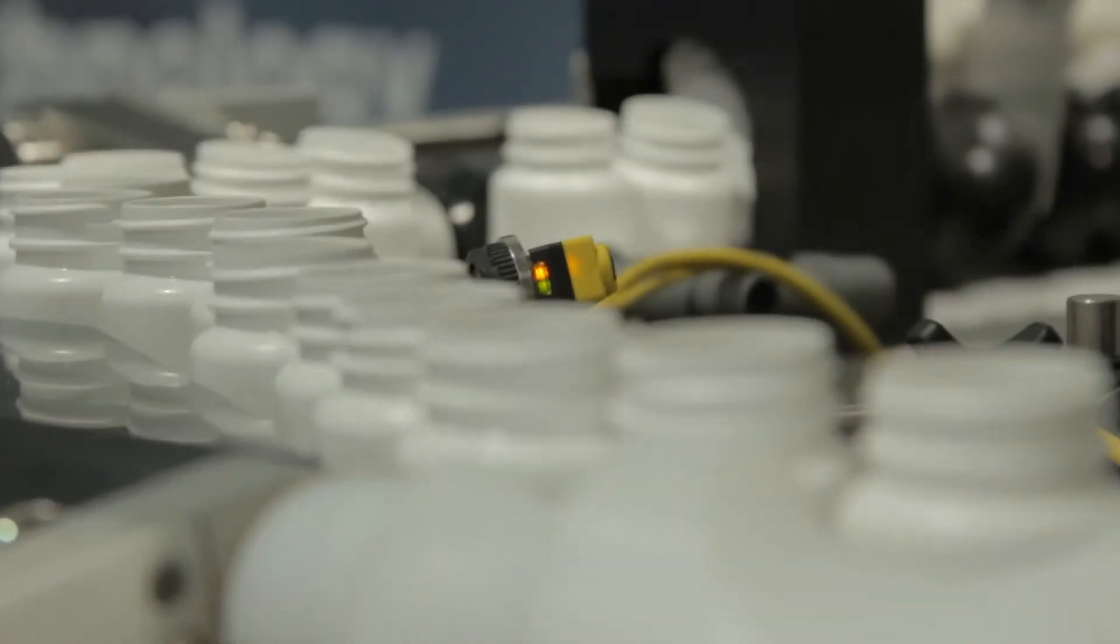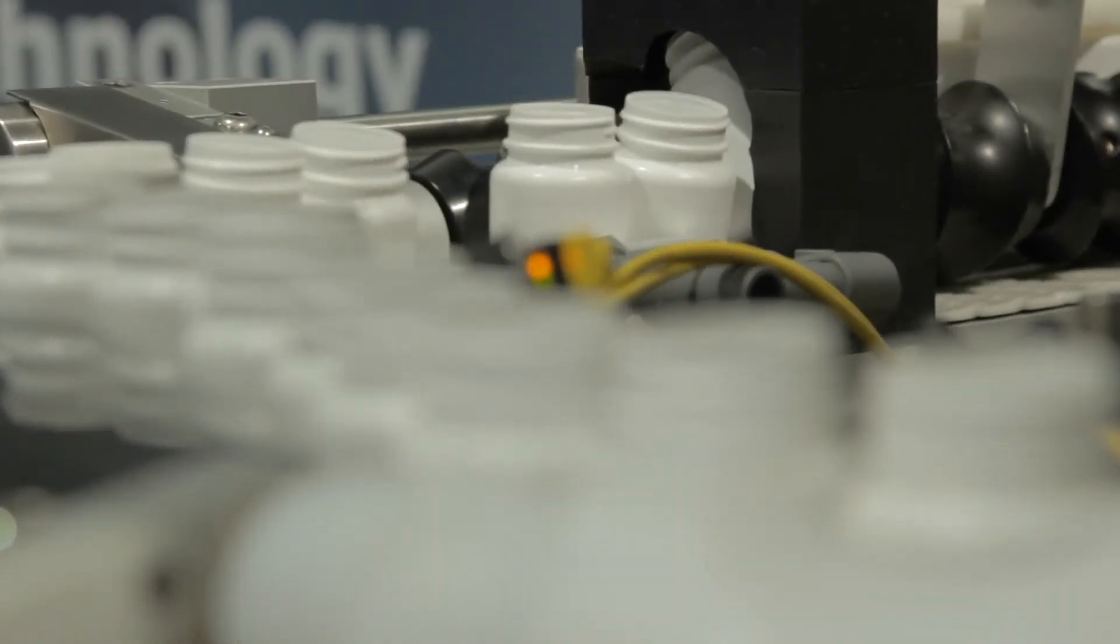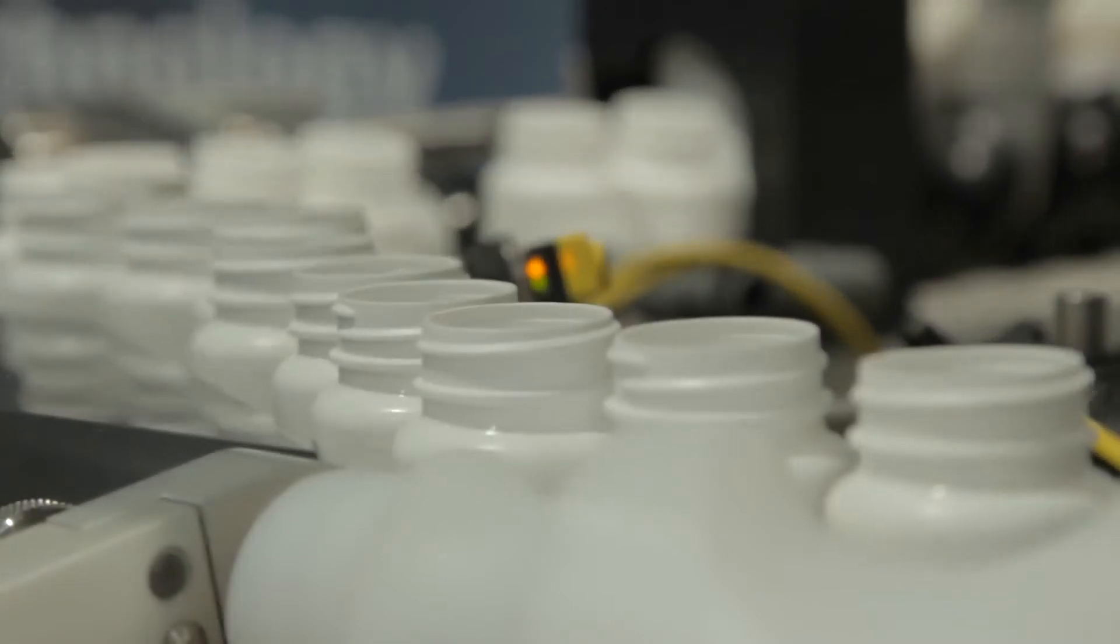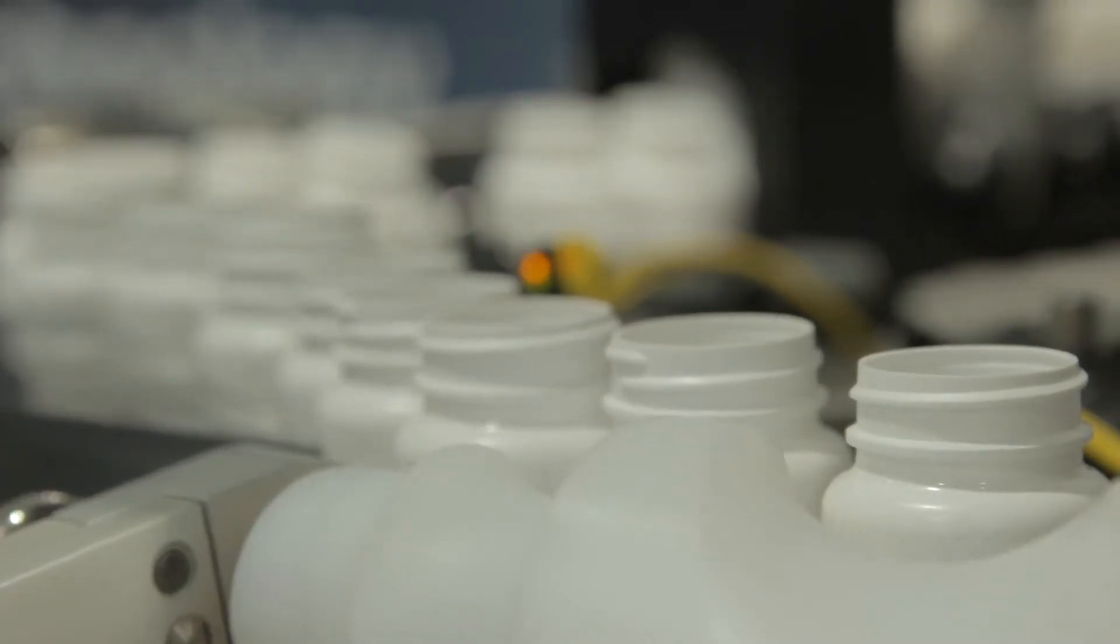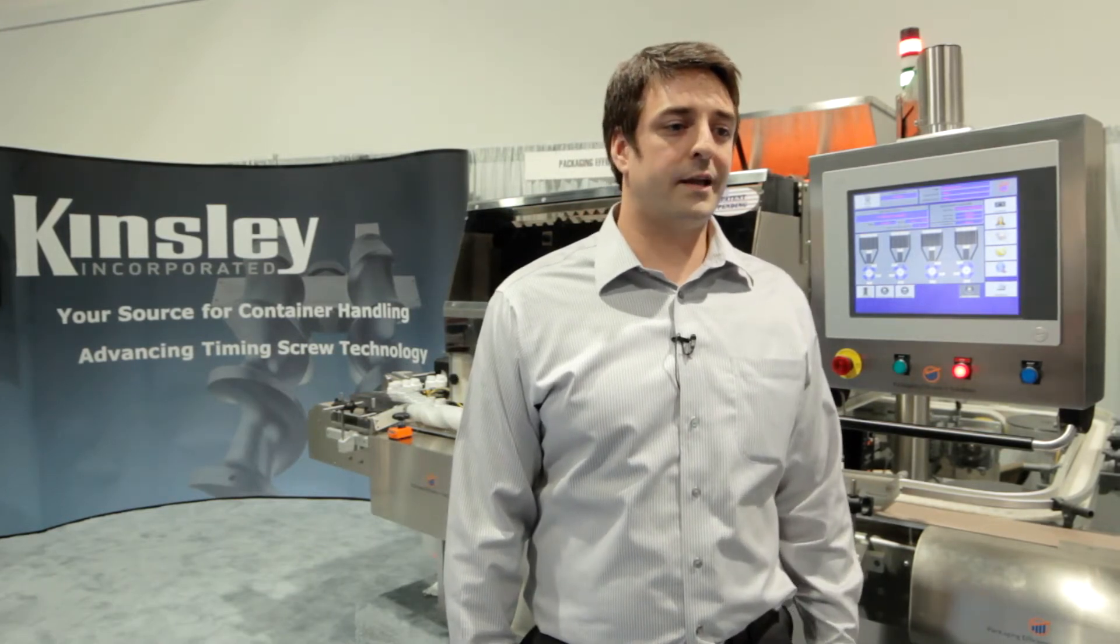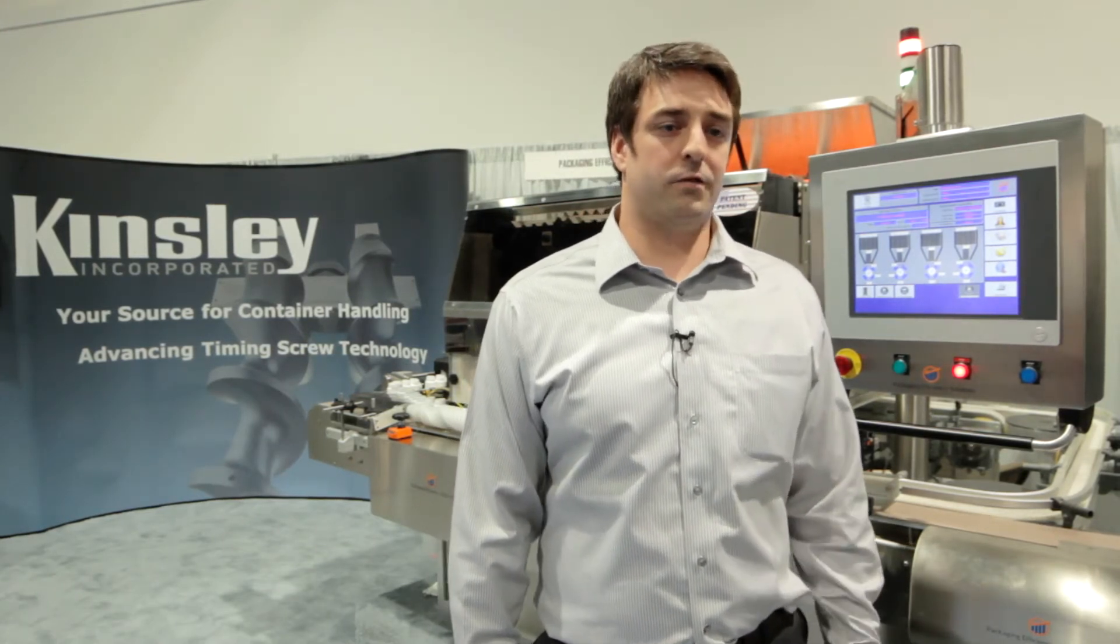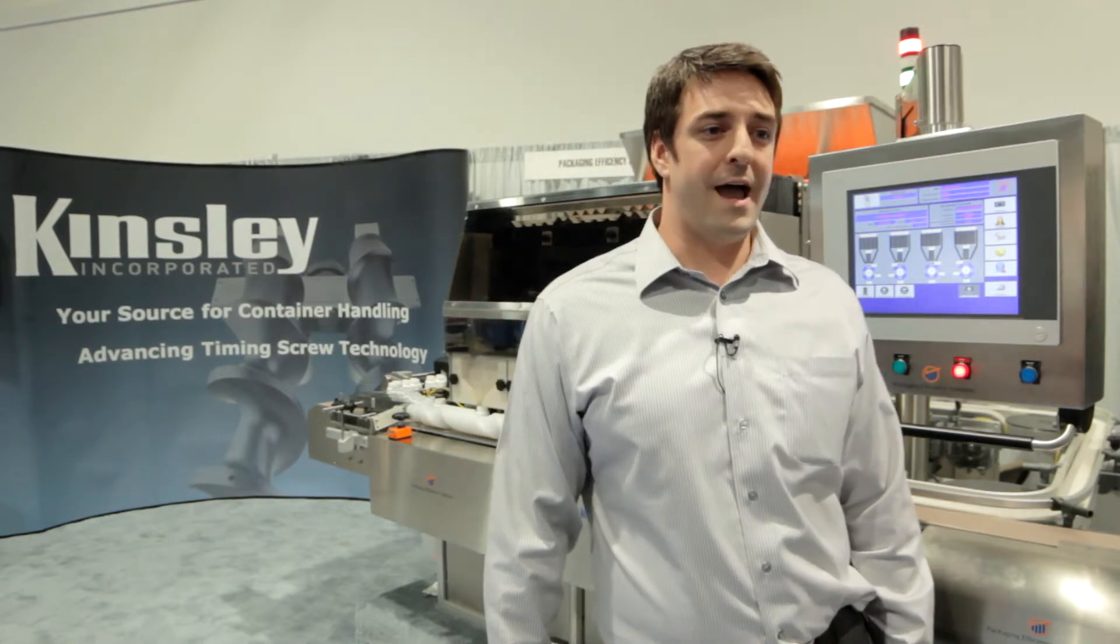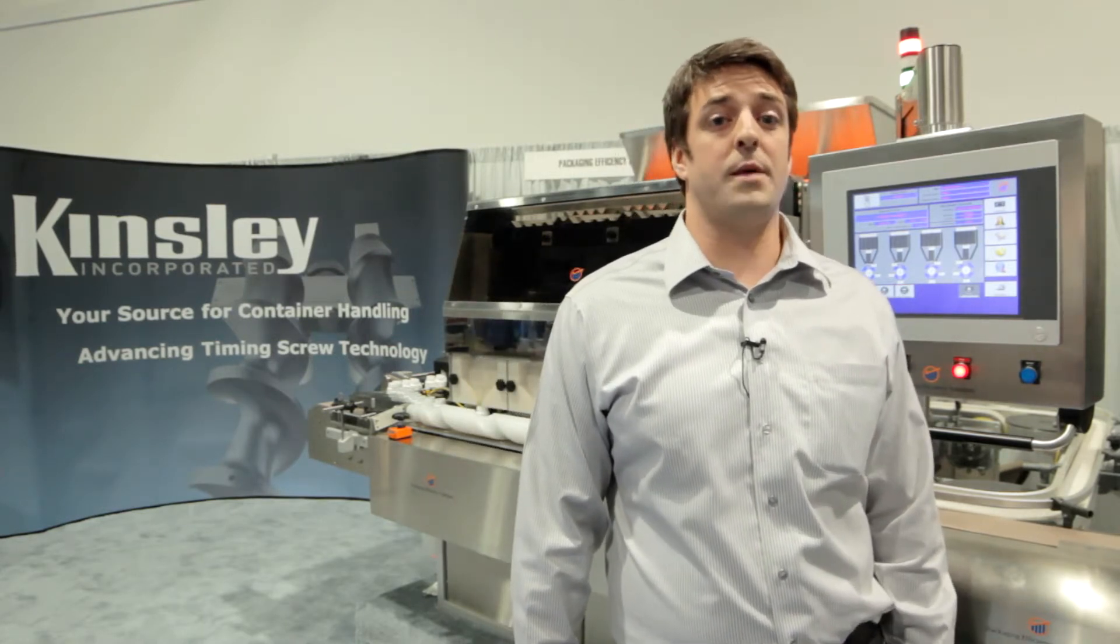We're here at PAC Expo Las Vegas 2013 to display our new PES100 electronic tablet counting system. The machine utilizes B&R components to count, manage, and distribute product to bottles at rates up to 120 bottles per minute.